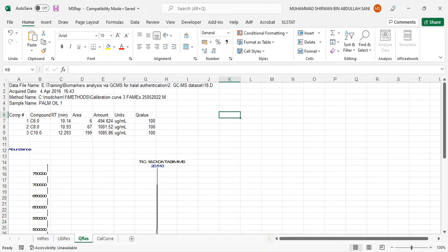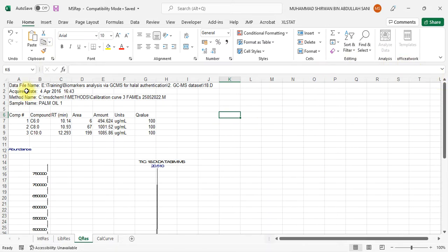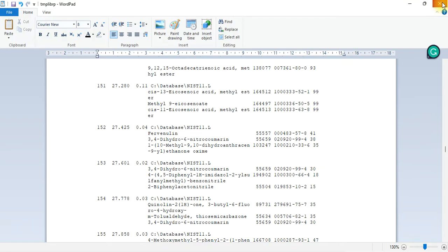Okay, so how about we try to go for the large sample? For this one, you can save first, or if you don't want to save, you have to close. The Excel cannot be operating. They cannot create another Excel if you don't save and close the Excel. So this one I want to close as well.